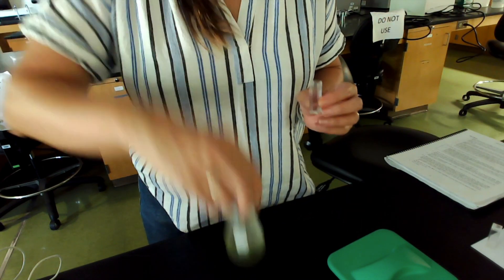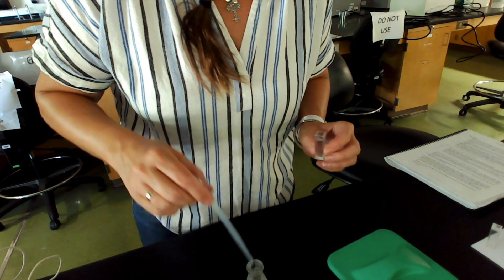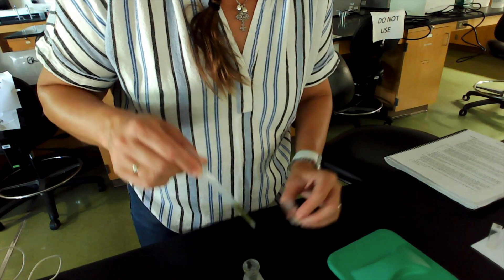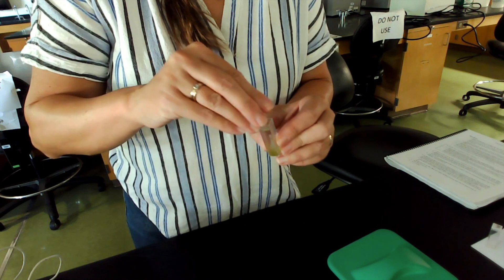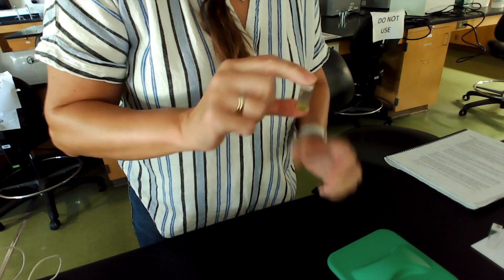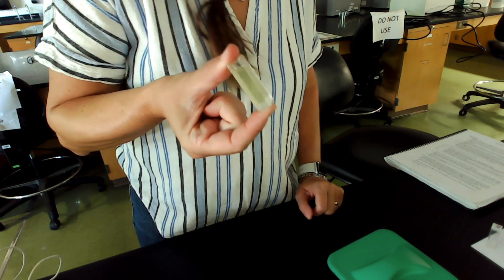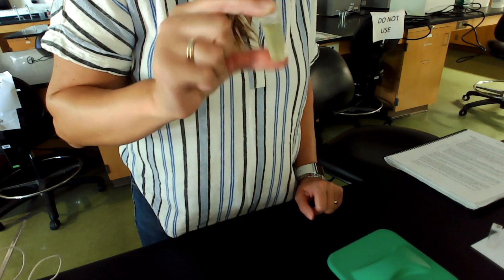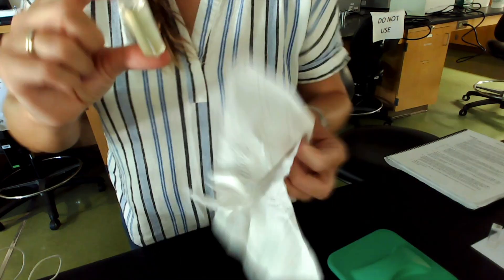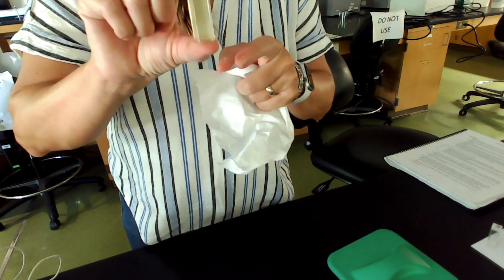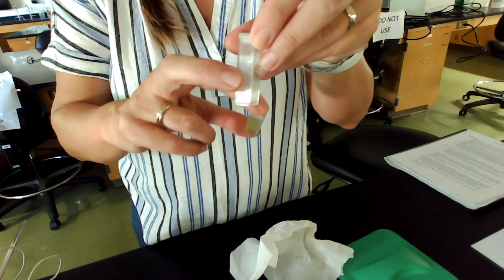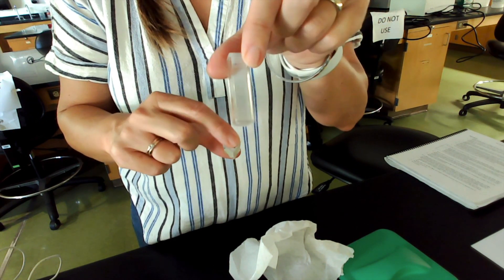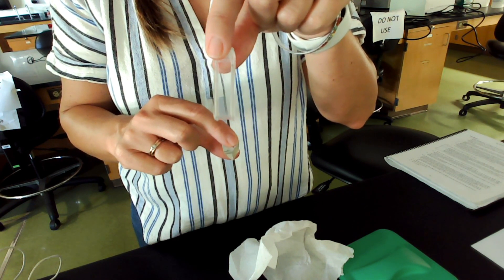This is my chloroplast mixture. I'm going to put in one, two drops of chloroplast. Put it back on ice. Put the lid on. It says to invert the cuvette to mix. This is still on step four. I'm going to make sure the sides of my cuvette. The cuvette has four sides. Two of the sides have ridges on them. You can't see through them easily. The other two sides you can see through easily. They're clear.